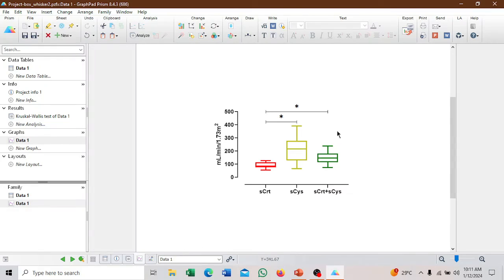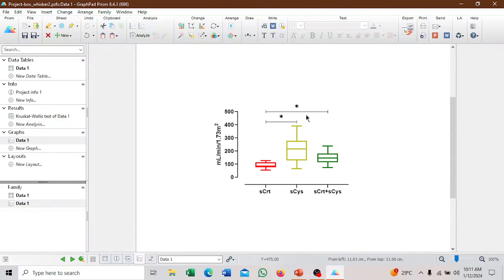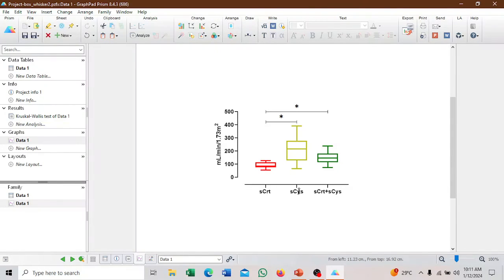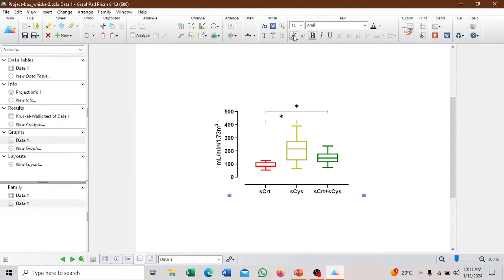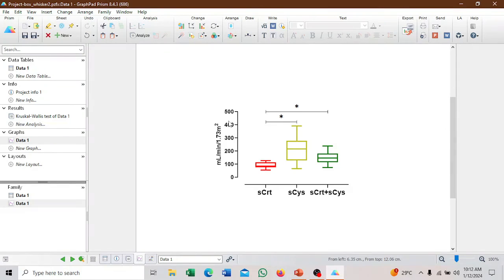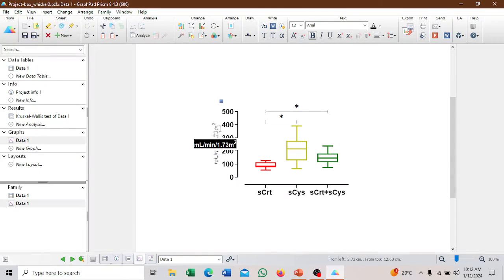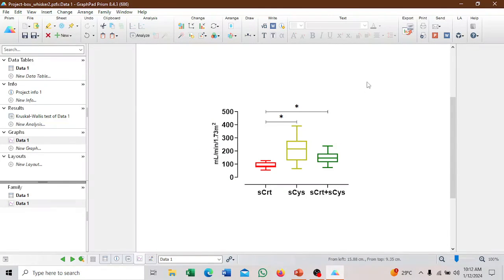In your write-up, you have to define what the star means. Star is P value less than 0.001. If they were different, you can put one star, two star, three star and define them. We can increase the font size for axis to 14. We can increase the Y to also 14. For the unit, we can leave it at 12. This is how you create the box and whisker plot.